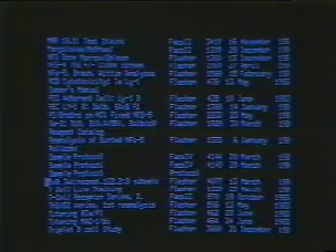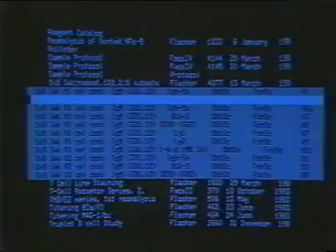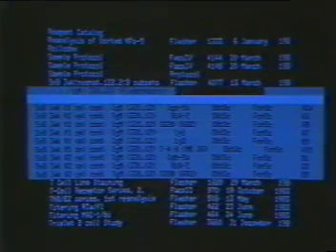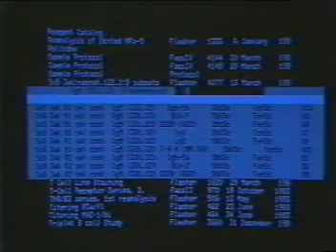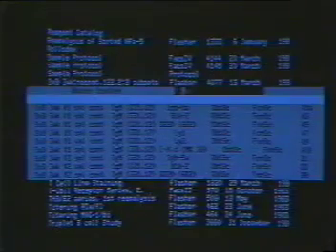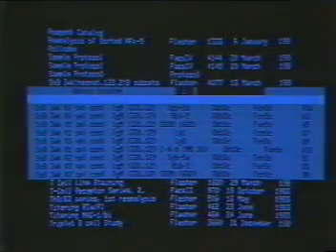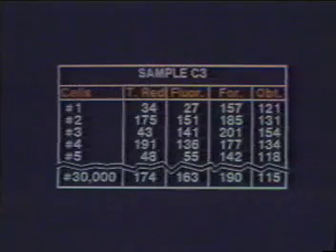Giving the down level command opens the drawer, revealing a set of gray sample lines, one for each sample in the experiment. Going down level a second time reveals a blank white analysis line on the card for sample A1. To request any type of analysis, press Insert. The secretary responds with a series of prompts. The answers you give in response to these prompts determine what type of analysis FACSDesk will deliver. When the final prompt has been answered, the secretary places a description of the requested analysis onto the white analysis line. This request is for an integration value.